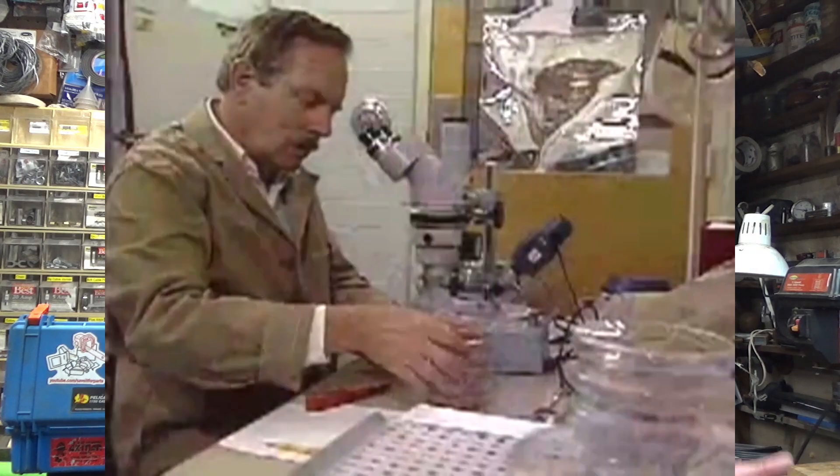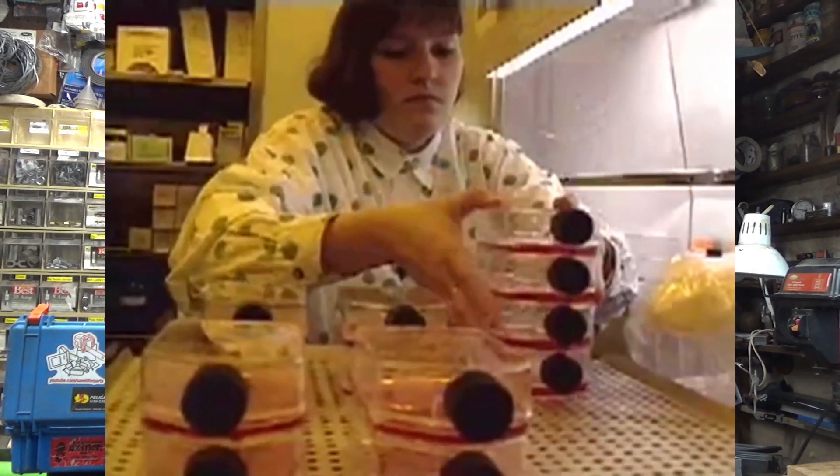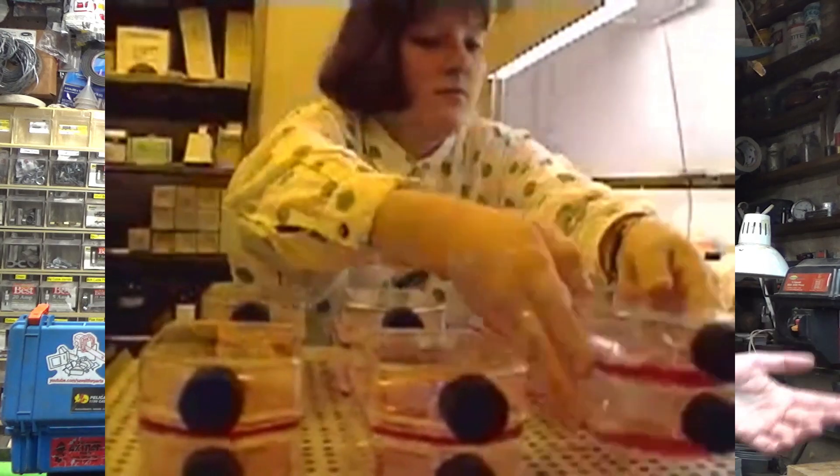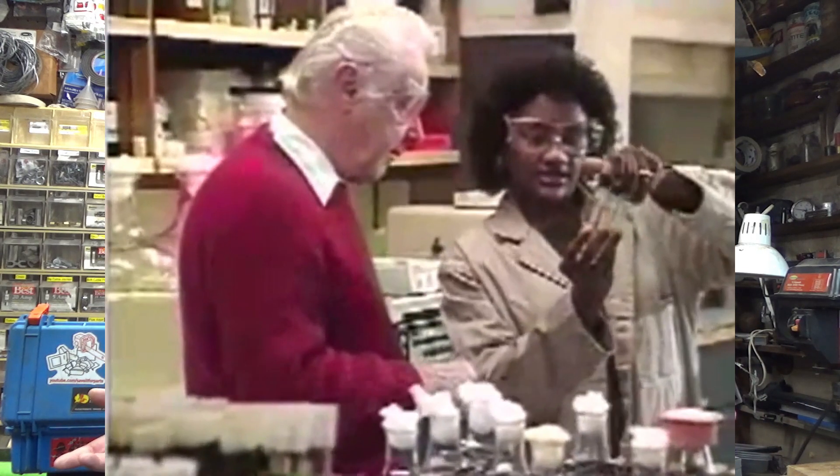To add even more complexity, this DNA sequencer doesn't actually take a random DNA sample and produce a result. It's just a step in the middle of the whole DNA analysis process. I would need a bunch more lab equipment to do the precursor steps and the after-processing steps to get anything out of this.